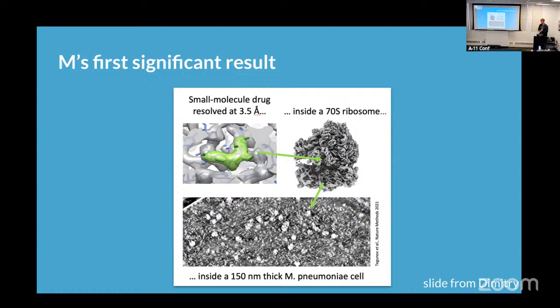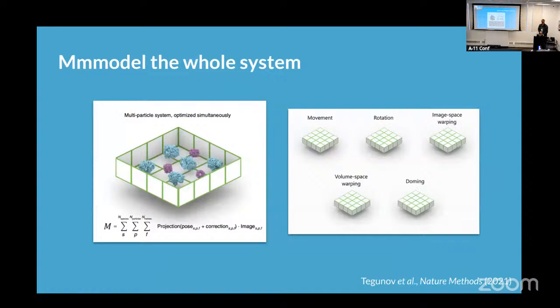Whether or not that's a reality for your own projects and for projects that we do today very much depends on the specifics of your sample. Is the molecule flexible? Are you able to collect really thin lamellae of your complex piece of biology? But in principle, this is possible in the best cases, and hopefully we'll be able to, by improving methods, continually expand the set of things that this is possible for over time.